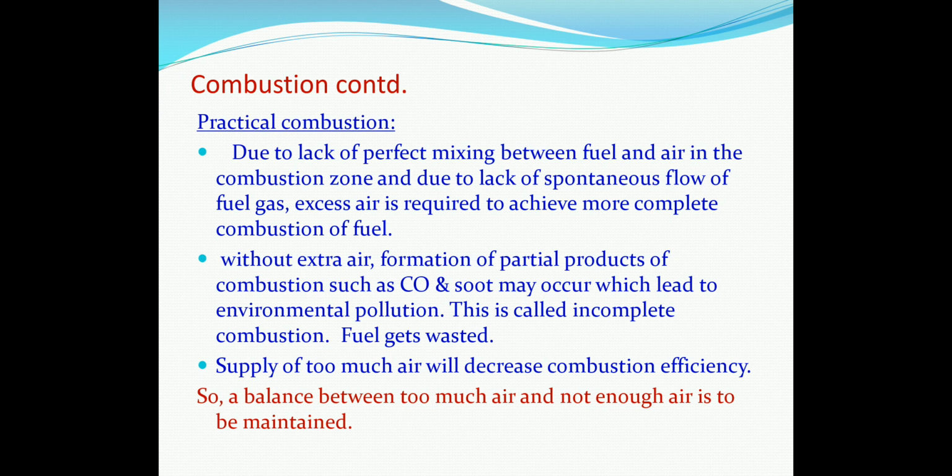This is called incomplete combustion. Fuel gets wasted. So supply of too much air will decrease combustion efficiency. So a balance between too much air and not enough air is to be maintained.